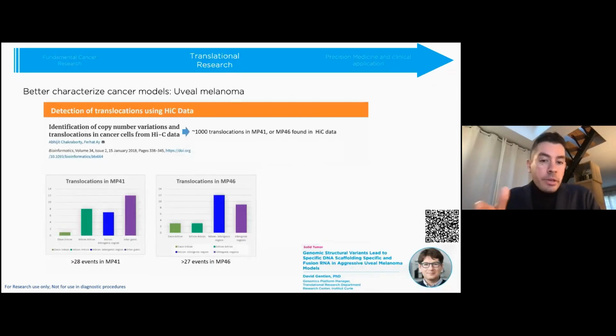Many cancer study models are established and characterized and associated with specific genetic defects that help to understand the development and evolution of this cancer. But because of the limitations of NGS and cytogenetic approaches on tumor tissues, it is clear today that a lot of genetic alterations remain to be discovered, and that our understanding of these models is by far incomplete, with the certainty to identify new biomarkers or therapeutic targets.